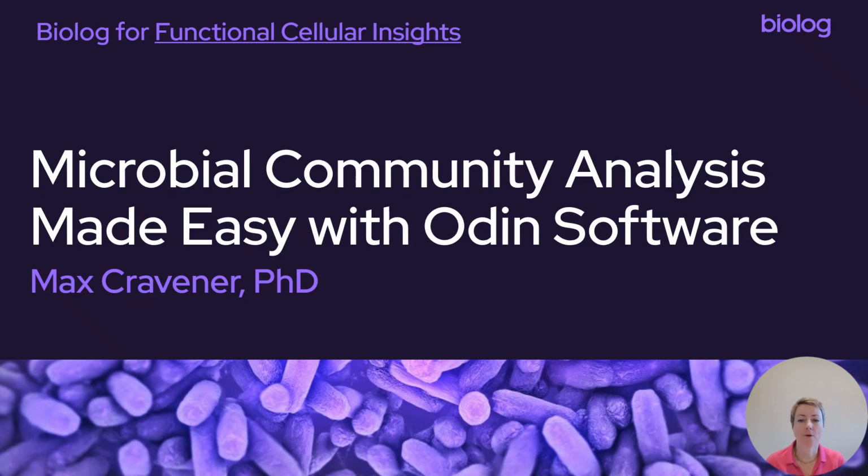Today's webinar is titled Microbial Community Analysis Made Easy with Odin Software.